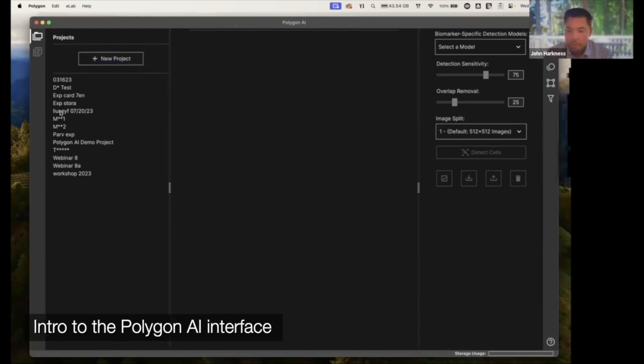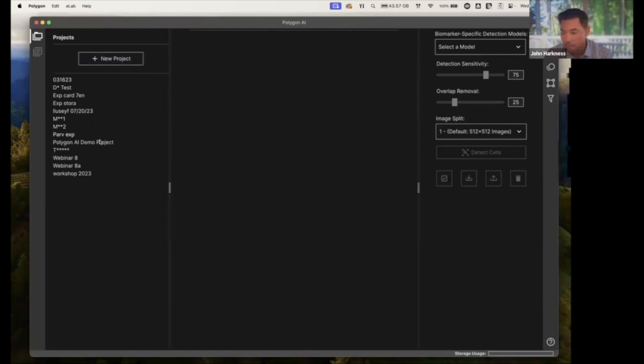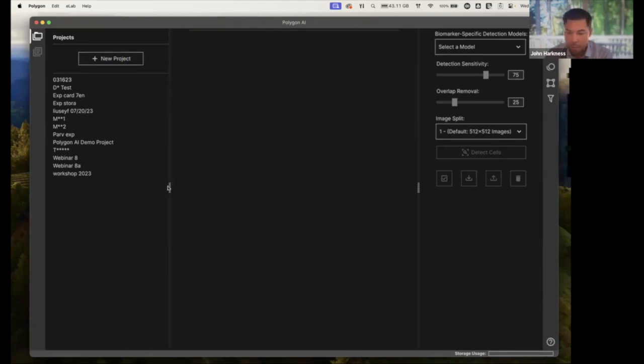On the left, I've got a number of projects that I've started. These are all the different image categories and experiments that I've put together. On the right, I've got some of my analysis tools. And in the center, you're going to see our image panel.